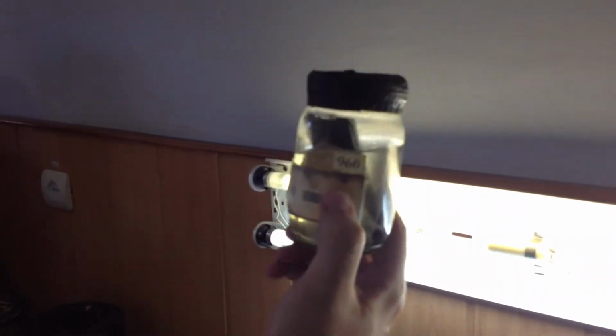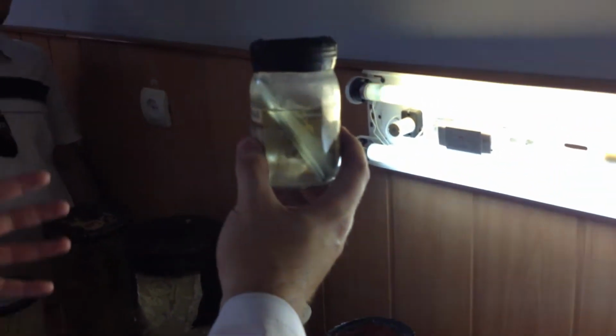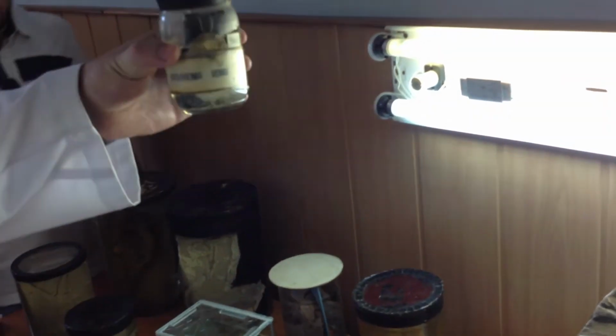Ask, guys, yes. Yes, Benjamin, ask. As much as we can. So this is an example of a benign tumor of the skin. So the sample is presented with a part of skin with a round-shaped tumor, which has clear borders with surrounding tissue. It has a cauliflower appearance and so on. So this is just an example of papilloma.